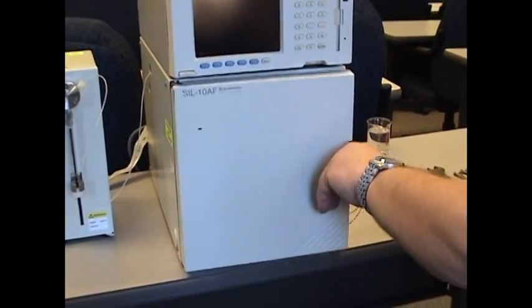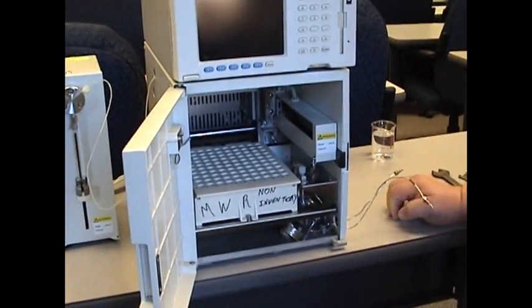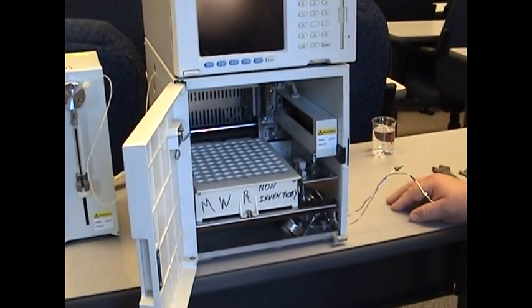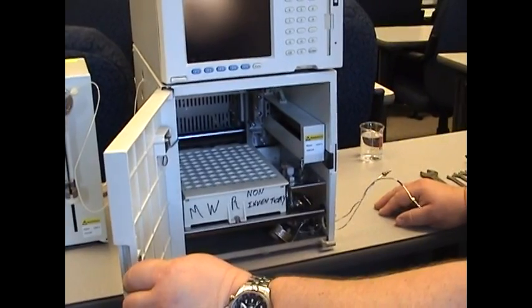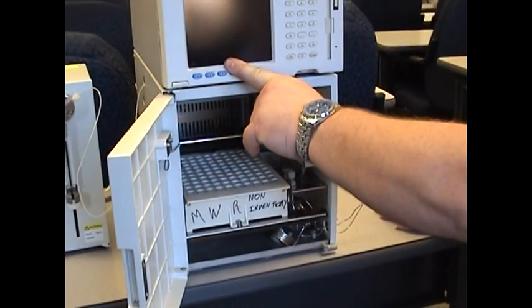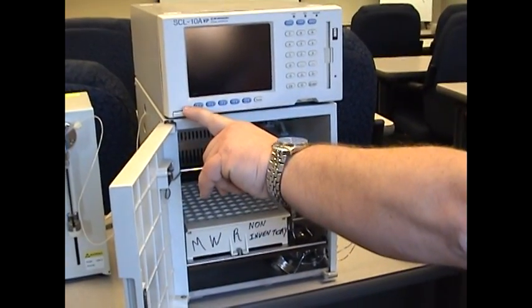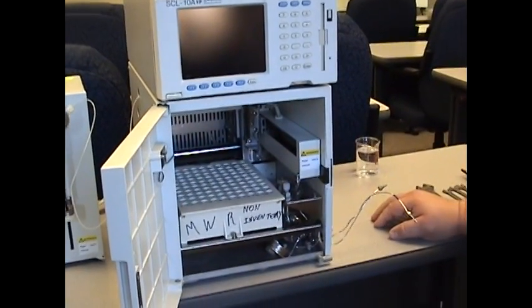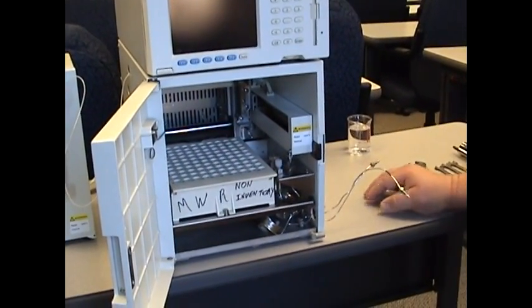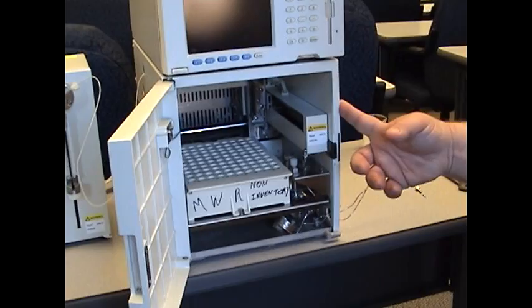Let's talk about how we're going to replace the needle today in the instrument. First thing we want to do is make sure that the controller is turned off and we are backed out of any kind of software that you may have. That will turn off the power to the autosampler.